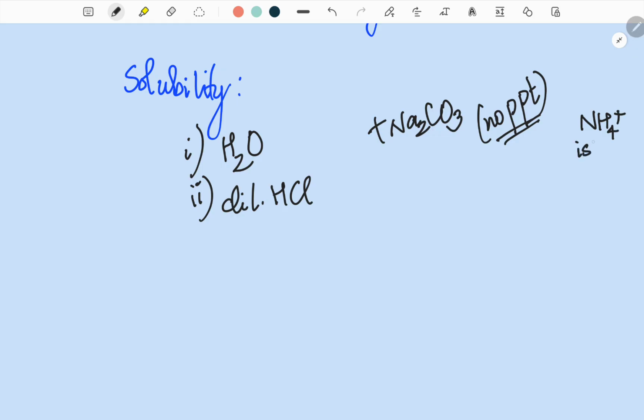Ammonium ion is present. I'm sorry, I'm mixing my words because it is something new for me, this YouTube channel. So initially I am making lots of errors while speaking, but I think I will get used to it. So I apologize for all the confusion that I'm causing. But what I meant is NH4 is present. Okay, so if you are not getting any precipitate, then NH4 plus ion, ammonium ion is present.